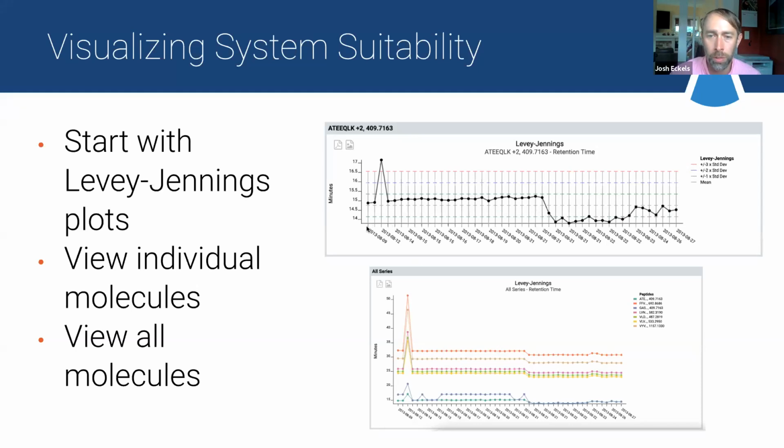The real world, of course, does not agree with that wonderful theory, and we've got some noise and variability. What we're looking to do is have everything within a normal predictable range. So the system will automatically look at all of our data points that we've acquired and calculate the mean and standard deviation. The definition of outliers here is anything that is more than 3 standard deviations from that mean. And I'll talk more about other ways of looking at this data downstream once we have it dialed in here and running reliably with these plots, to help expose other types of variability that are important. But this is a good place to start.